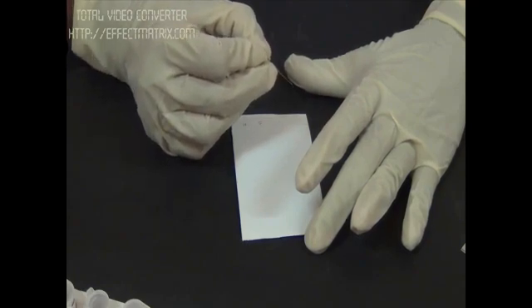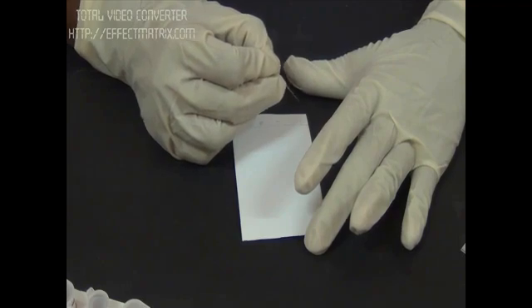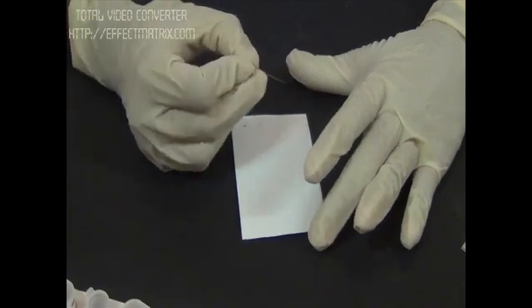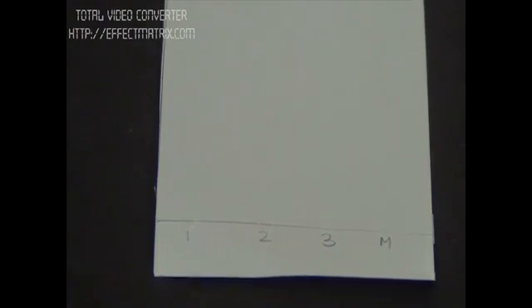Once we add a drop of sample onto the plate, we allow it to dry before we add another spot. Now we have loaded the amino acids on the TLC plate. Number 1 is lysine, second is methionine, third is threonine, and fourth sample is the mixture. Now the spots are dry.